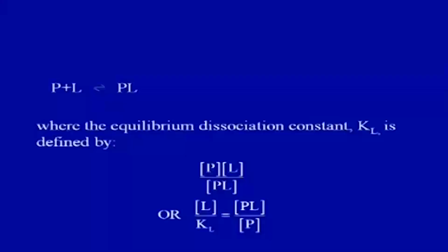So, these things need to be taken care of when you are choosing the size of the ligand. Now, affinity, like I said: the interaction of a protein, say P, and ligand L can be described as P plus L equilibrates with PL, and the dissociation constant could be given by this equation here.